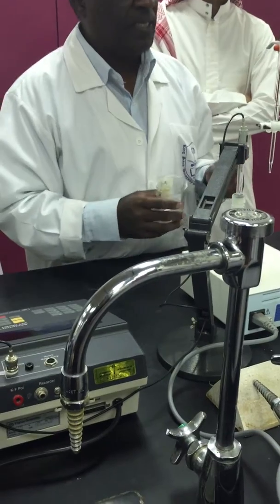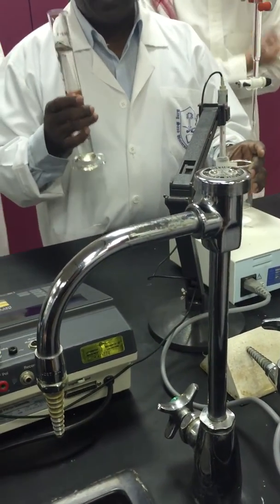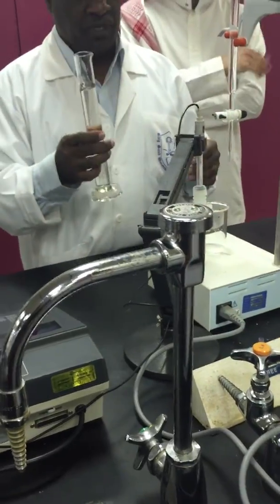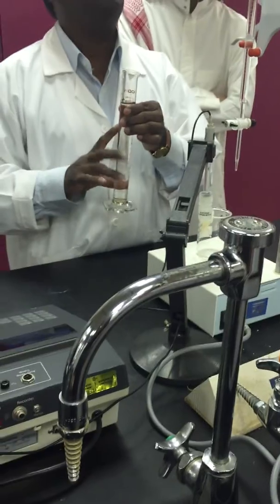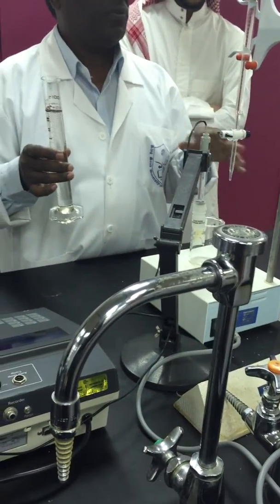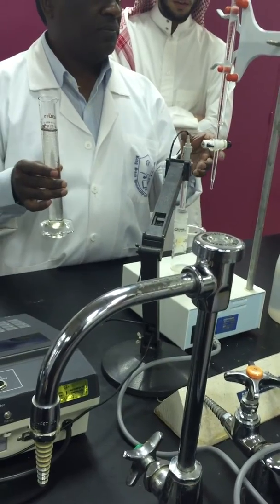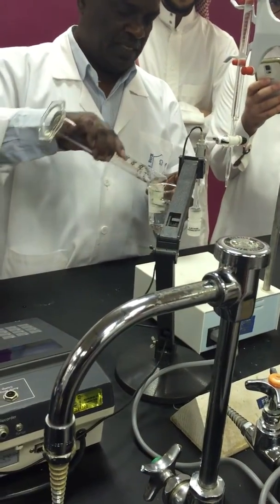Now for pH and alkalinity, you will see this is the sample. You should know how much sample volume you have to take. So how much do we usually take for pH alkalinity? 100 milli. So for pH alkalinity, I take 100 milli sample.